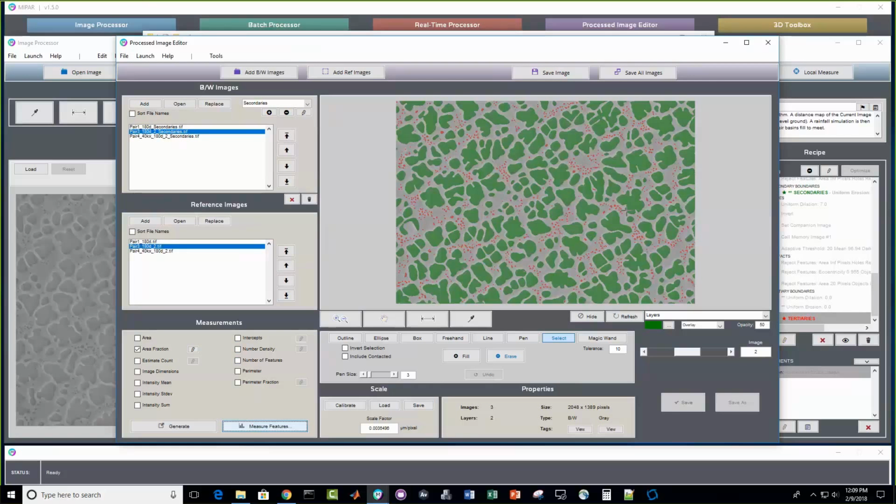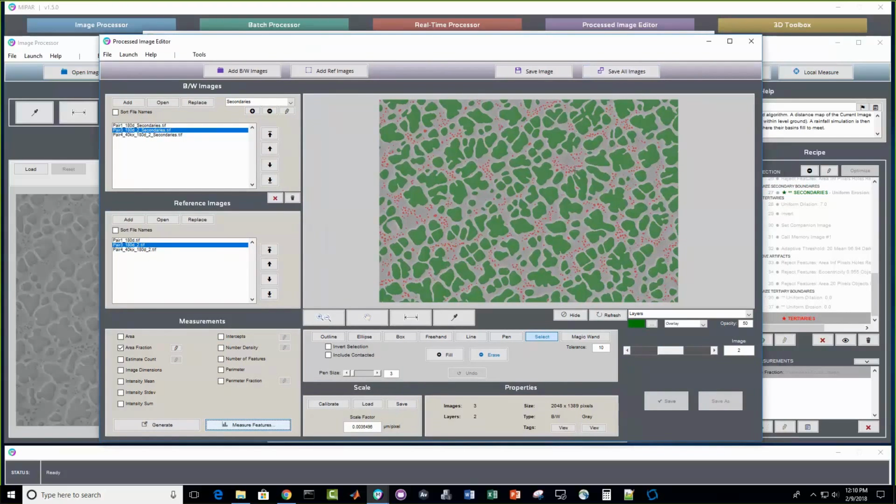It's a great question, Elias. I think all of us that work in material science, especially in image analysis, are aware that there's never a perfect image. Sometimes, despite our best efforts, there are artifacts that are introduced, and those artifacts are not always consistent. As you mentioned, they can come in the form of gradients, noise, or sometimes degraded phase contrast between phases. So you're absolutely right, there are many ways to go about that. I don't know that I have a very helpful example that can answer the question across all cases. My short answer is that it's really going to be a case-by-case thing.